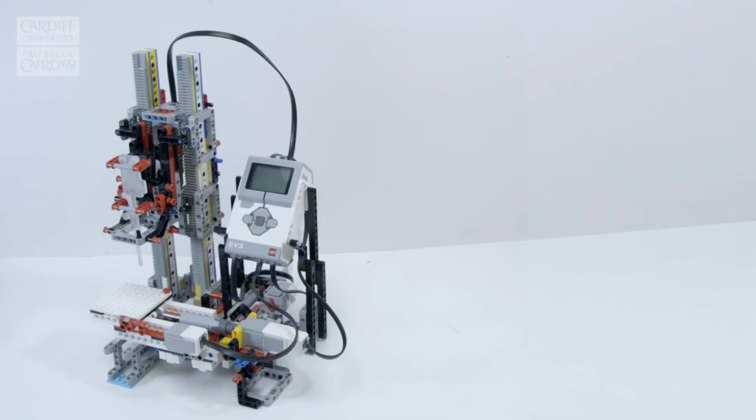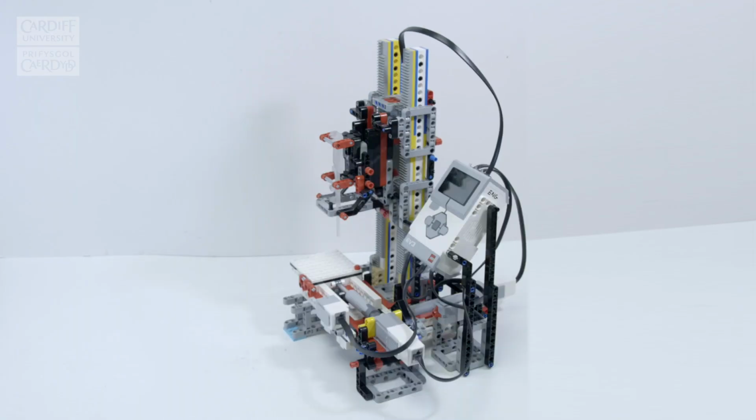So LEGO is a very versatile construction toy, essentially, but it's manufactured to very high precision, very high tolerances, and you can build things with very high reproducibility from one build to the next, surprisingly high actually. It's readily available and it's cheap.